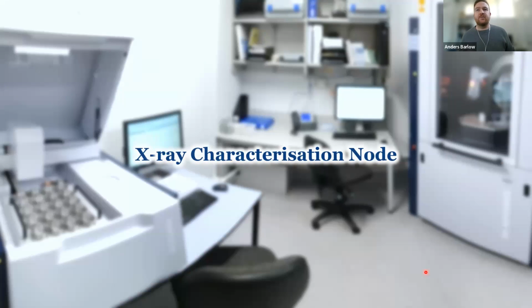Okay, so today we are giving an overview of the Xray characterization node of the platform. And this is really just an overview. So we're going to be introducing the two different techniques that we have on the platform, Xray fluorescence and Xray diffraction. Give you a little bit of background information as to what these techniques are, what those techniques will tell you about your samples and how you can apply them together in a complementary fashion. And also we'll touch a little bit on the requirements that are needed for sample preparation for these particular techniques.